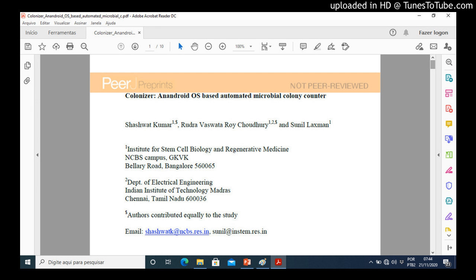Images taken under ambient lighting show substantially lower accuracy and higher fluctuation than the box and the hood, as also illustrated in Figure A. We also tested the app performance across different devices and found low variation among them.